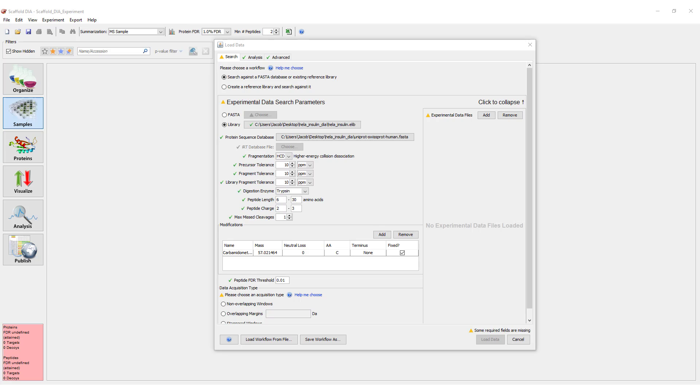When searching a Skyline Blib, you have the option to provide an IRT database file as well. Scaffold DIA does not require retention time normalizing peptides, so this file is optional.